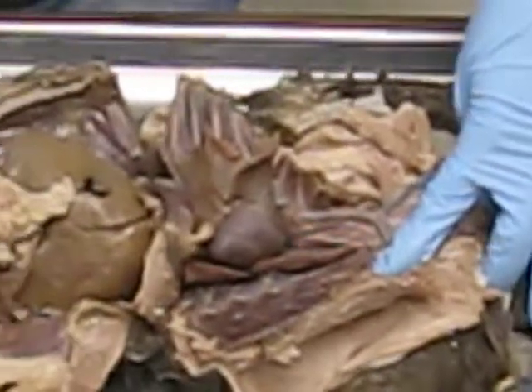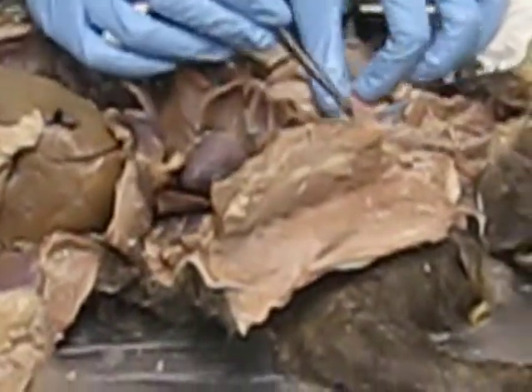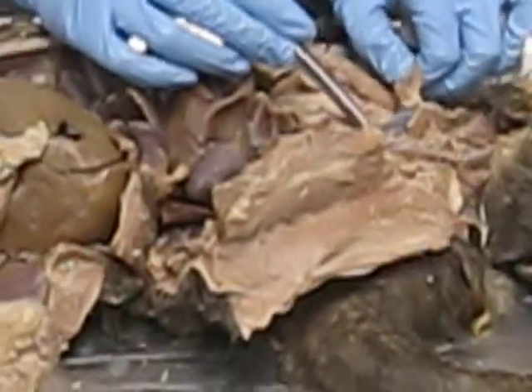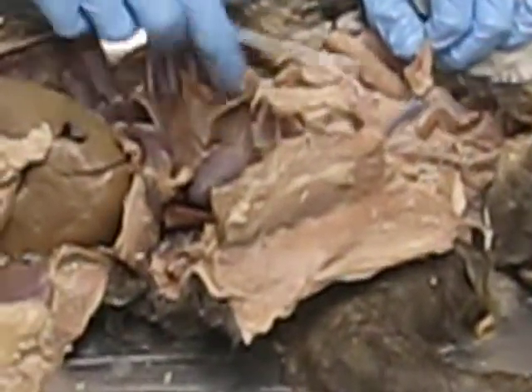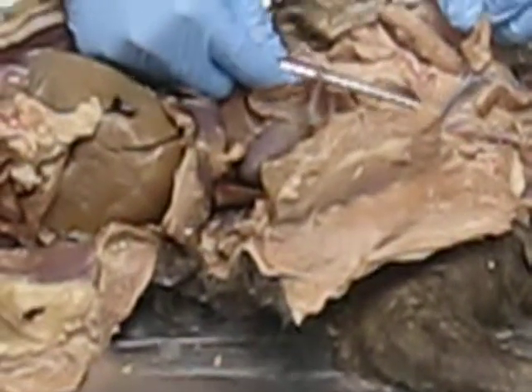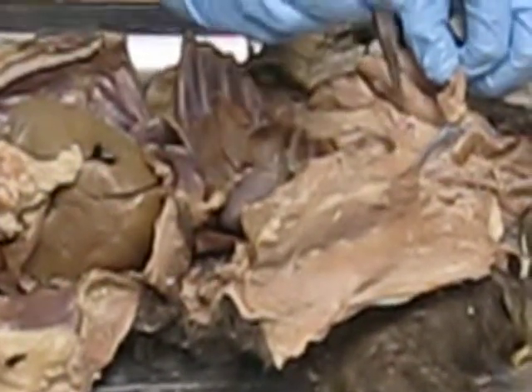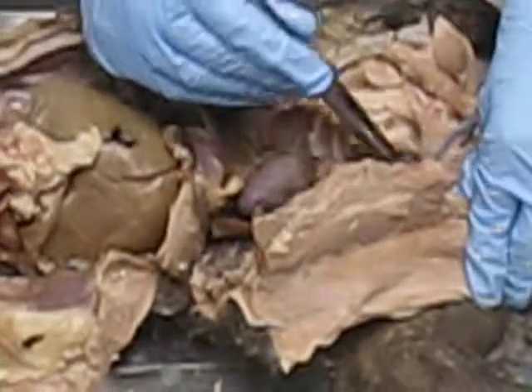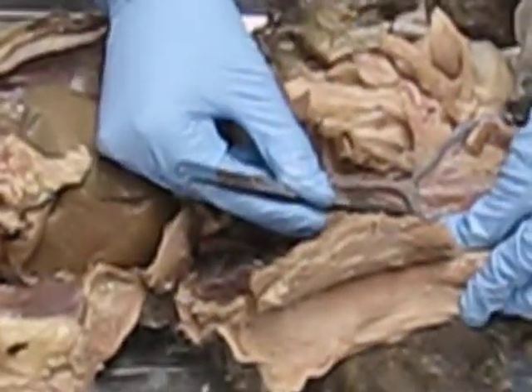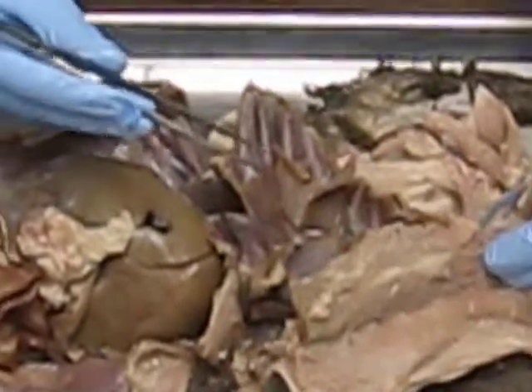But basically, let's see here, let's do that. There's a subclavian. It's not dyed well at all on this animal, but it's right here, this one. But again, it's the same concept. It's subclavian until it gets past the first rib, then it's axillary, and then brachial. And it's on the same side here. So here's subclavian. Once it's past that rib, if we were to cut this open in the armpit, axillary, brachial.